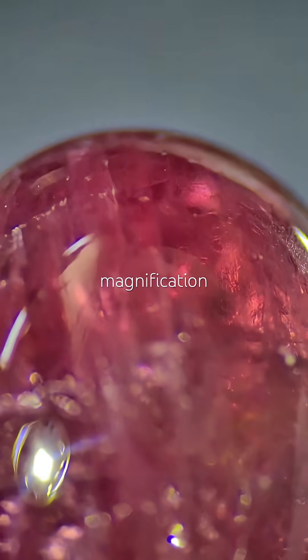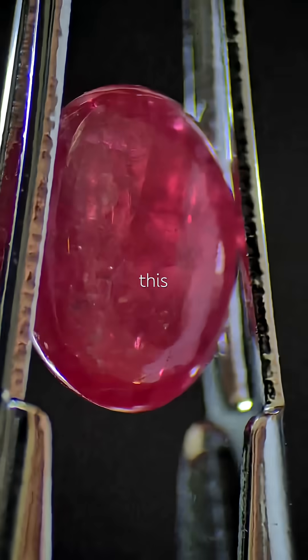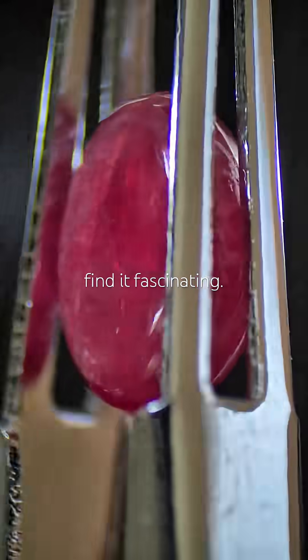Under magnification, the color is quite uniform, even though it's very included. There's this structure inside, almost like a grid or tic-tac-toe. I find it fascinating.